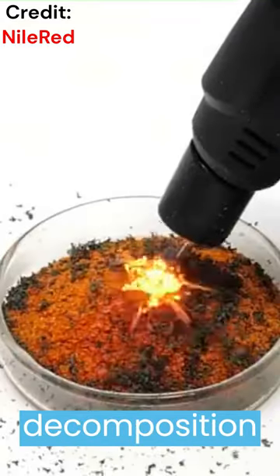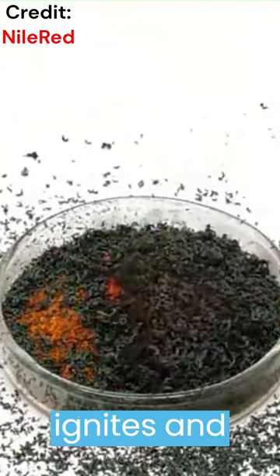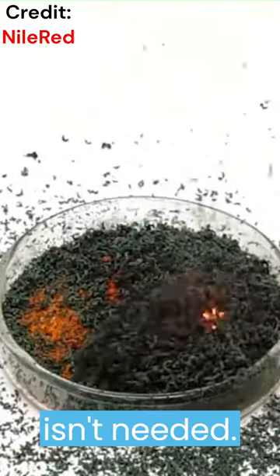This reaction is a demonstration of a decomposition reaction where ammonium dichromate, an orange-red solid, easily ignites and burns in a self-sustaining reaction, which means that oxygen isn't needed.